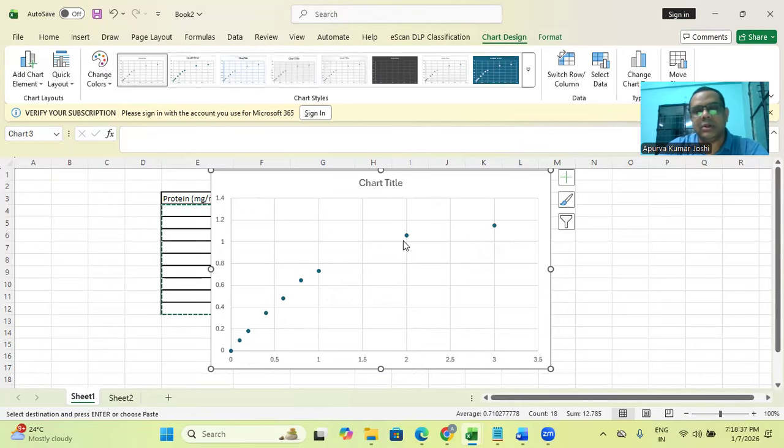We all know that the linear relationship only extends up to a particular concentration, beyond which the linear relationship is lost when you're looking at UV visible. I mean, when you look at absorption of UV visible radiation by chromophores. Typically, when we have graduate students, we ask them to consider a standard curve taking a concentration range which is well beyond linearity, and we want them to appreciate the limitation of Lambert-Beer's law as far as a certain threshold of concentration is concerned.